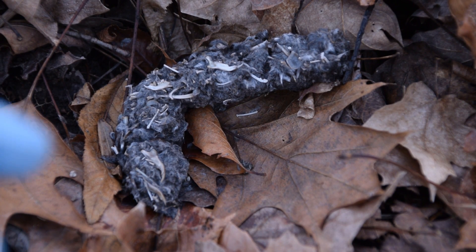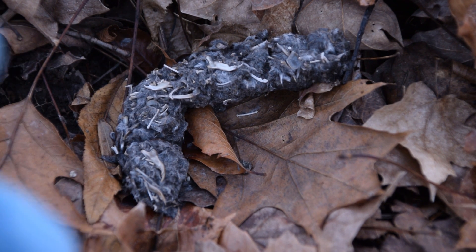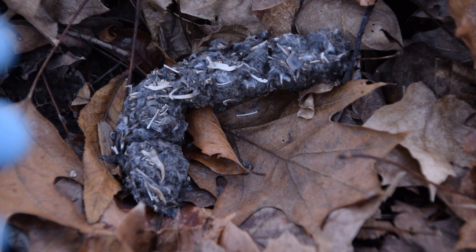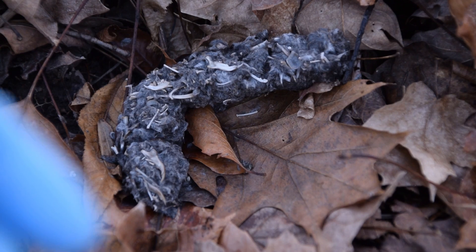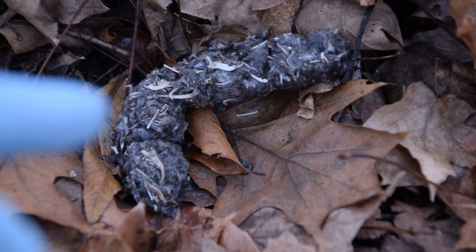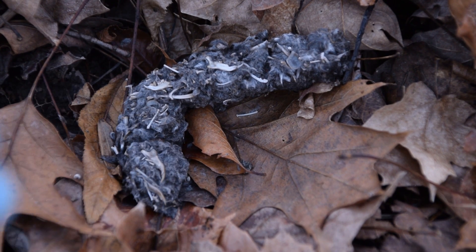Now there are a couple of different ways that I can tell this is an owl pellet. Number one is because of all the bones in it. Owls don't have any teeth, so they can't actually chew up their prey. They swallow their prey whole and regurgitate or vomit out these pellets that are full of bones, teeth, claws, and any other hard part of the animal they could not consume.